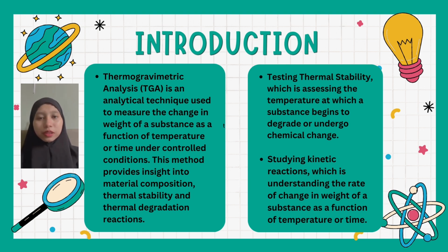Next, the objectives that we get from this experiment. First is testing thermal stability, which is assessing the temperature at which a substance begins to degrade or undergo chemical change. Second is studying kinetic reaction, which is understanding the rate of change in weight of a substance as a function of temperature or time.